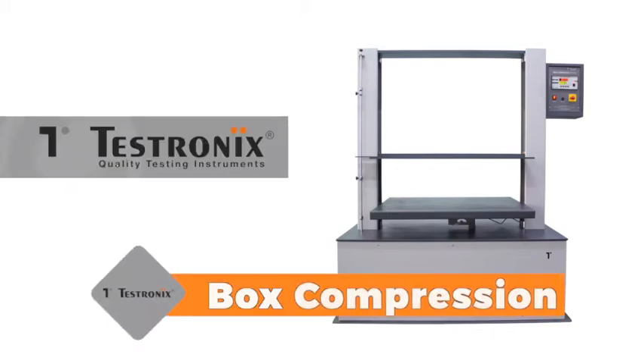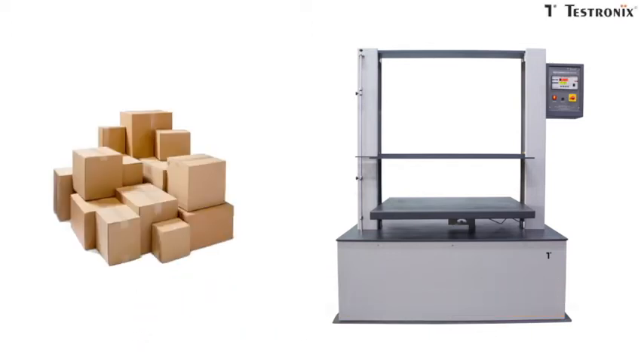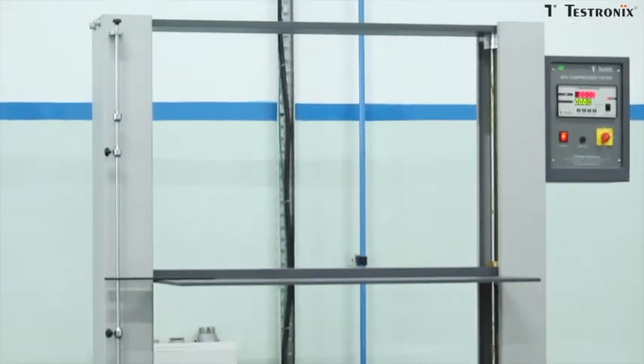The TXBCT is a Box Compression Tester which is used to calculate the compression strength of corrugated boxes and cartons. This instrument consists of strong and rugged compression plates.